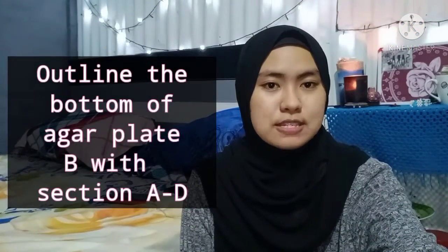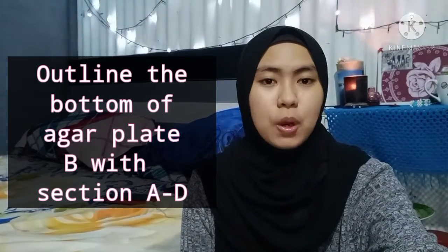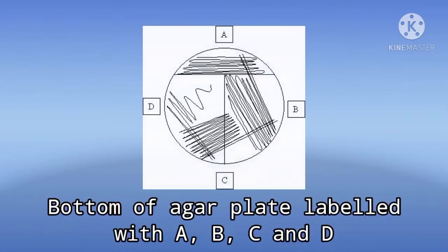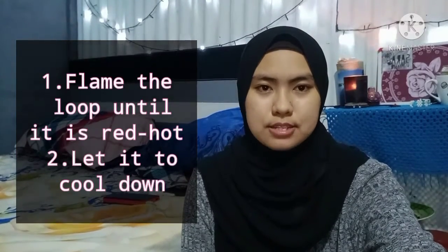Next, the agar plate B needs to be outlined with 4 sections from A to D on the bottom of the agar plate, as shown in this figure. This will make the quadrant streak method easier to do later. Then flame the loop until it is red hot and let it cool down. This step is important because it will sterilize the loop and make sure to kill any unwanted bacteria that are present on the loop.